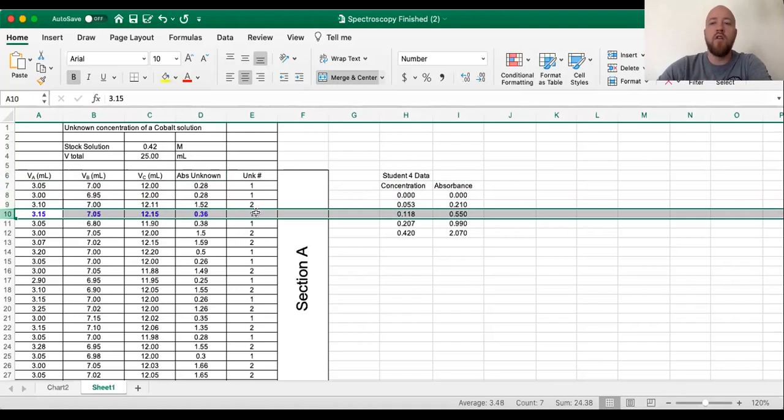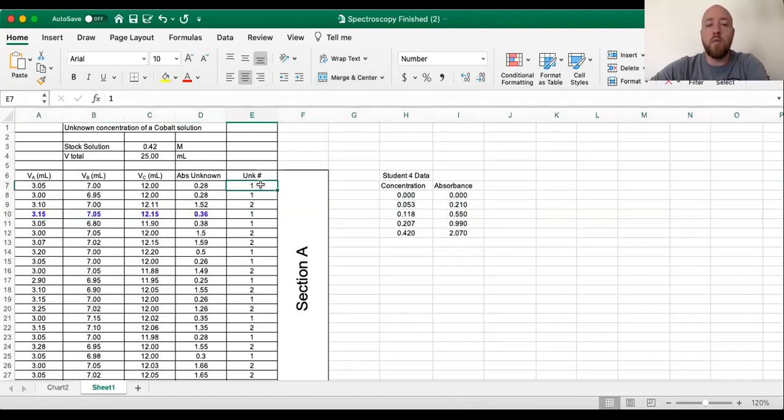So you have many samples being taken. So usually, if we are concerned about statistically viable samples, we want to take as many samples as we can. That way we get better results. Okay, so here you now have replicate data of unknown number 1 and many replicates of unknown number 2. So this would give you a good representation of what is the concentration for number 1 and what is the concentration for number 2, rather than just doing a single sample.